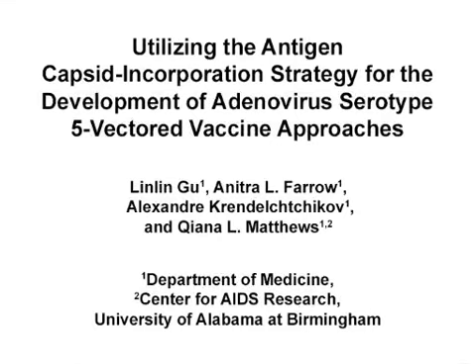The overall goal of this procedure is to utilize the Antigen Capsid-Incorporation strategy for the development of adenovirus serotype 5-vectored vaccine approaches using a recombinant divalent adenoviral vector as a proof of principle.